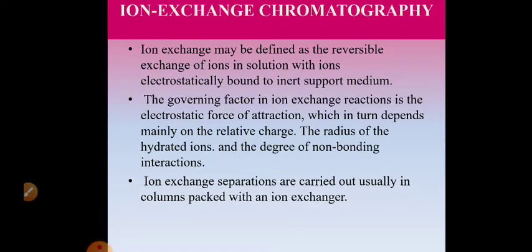The most important governing factor in ion exchange reaction is the electrostatic force of attraction, which in turn depends upon the relative charge, the radius of the hydrated ions, and the degree of non-bonding interaction. So electrostatic force of attraction is the major factor, but it depends upon the charge, the radius of the hydrated ions, and the degree of non-bonding interactions. Ion exchange separations are generally carried out in columns that are packed with ion exchangers.